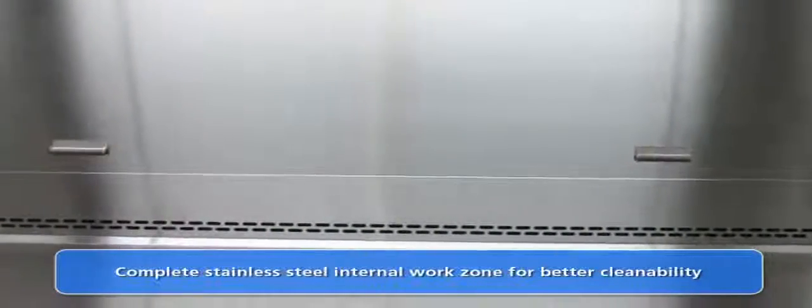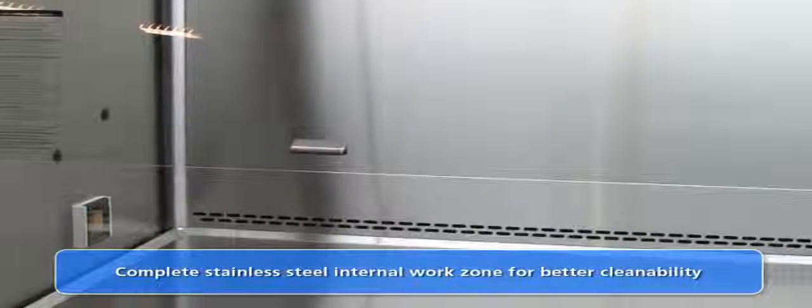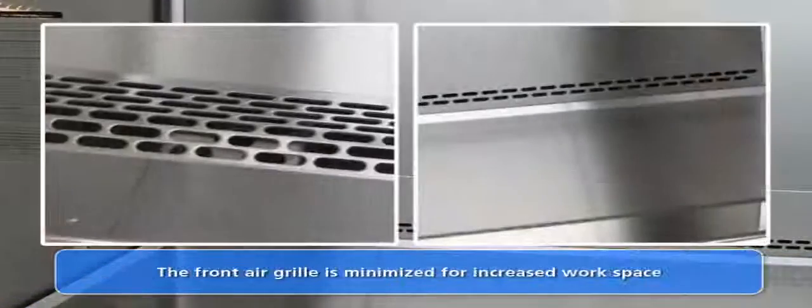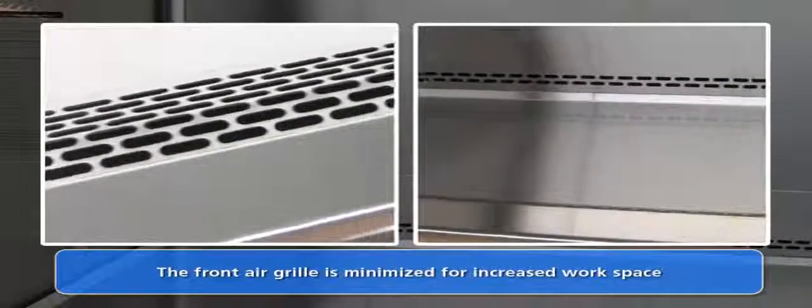Complete cleaning is simplified with the stainless steel internal work zone. The cabinet's internal side walls and back wall are made from a single sheet of stainless steel, a unique feature which eliminates any welded or sealed joints which may harbor contaminants. The front air grill is a single piece with the work surface. The sash window can easily be cleaned using maintenance mode and the new sash cleaning feature.